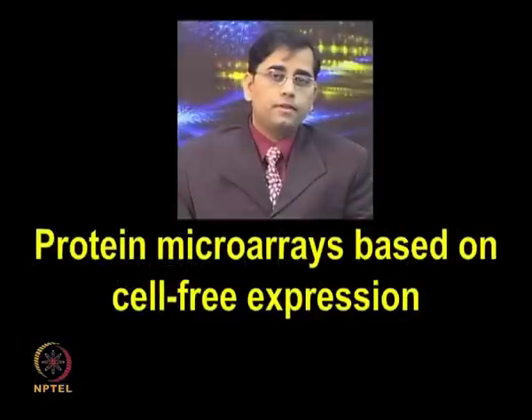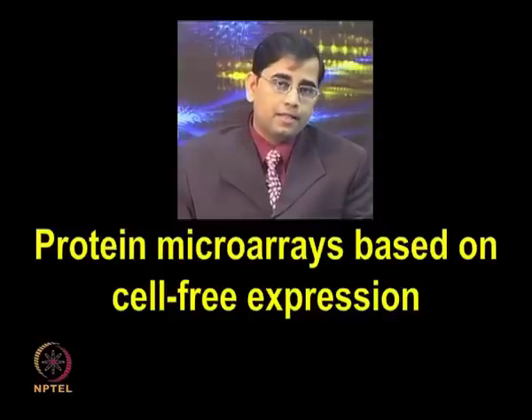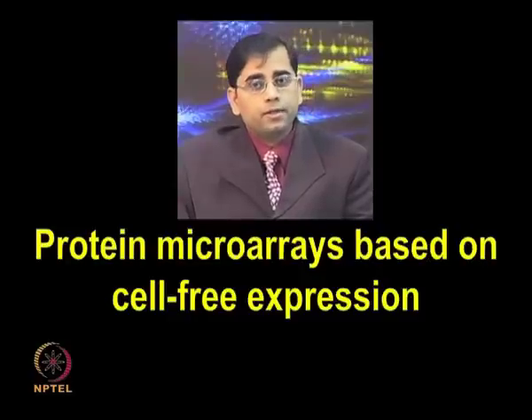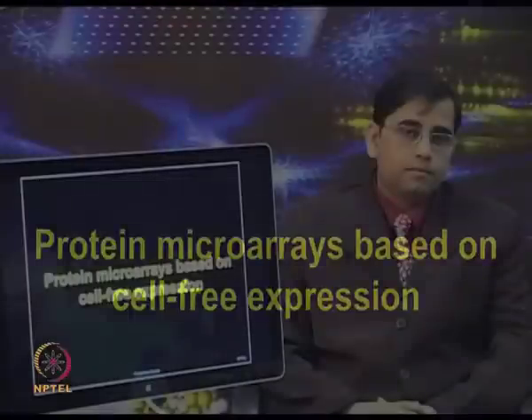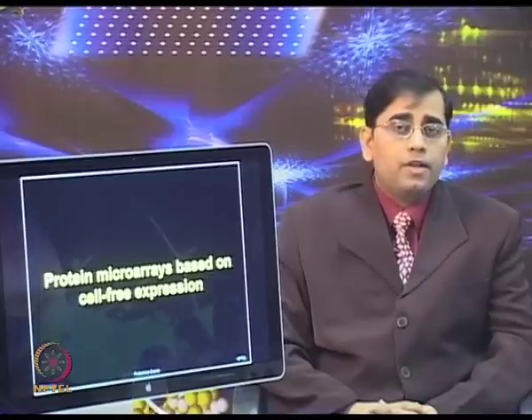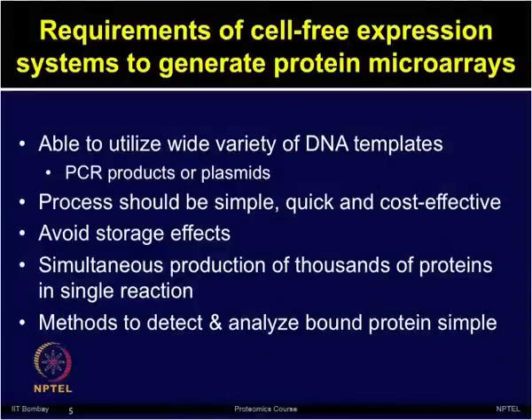So, let us now discuss protein microarrays based on cell-free expression systems. To eliminate the obstacles posed by traditional cell-based methods, cell-free expression systems are increasingly adopted to generate protein microarrays. There are several microarray generation technologies which have been developed over the past few years. So, now let us start discussing these techniques one by one. First of all, what are the requirements of cell-free expression systems if we want to generate protein microarrays?